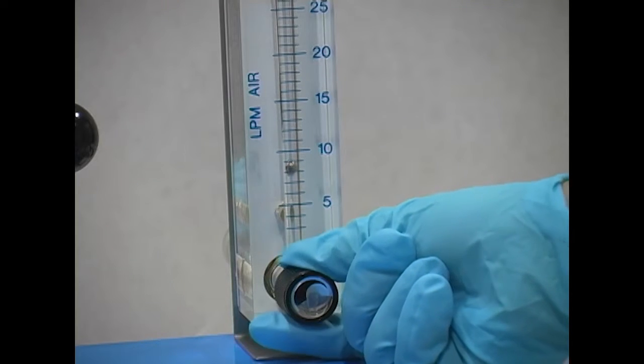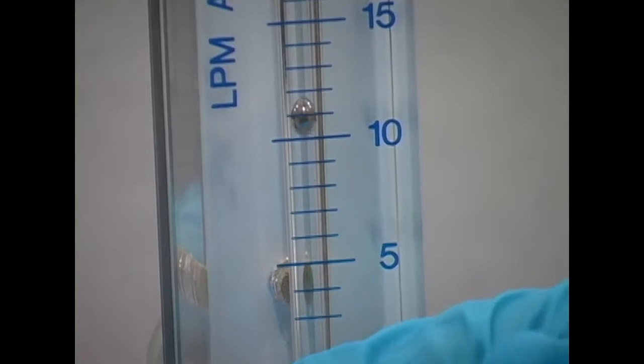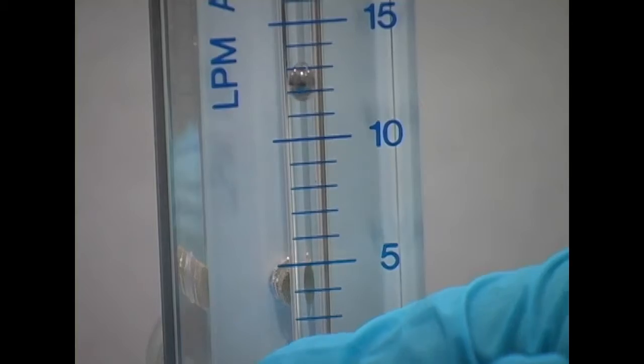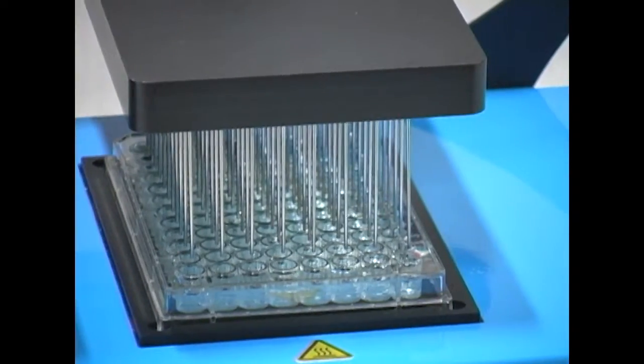The flow meter allows the user to easily adjust the flow of nitrogen entering the system. The user can choose between using one or all three of the manifolds with the flip of a switch.